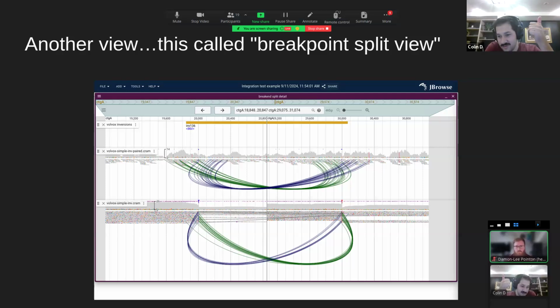Also, I want it to support loading a track into the spreadsheet. So that's kind of the reverse of what you mentioned. And then what you mentioned, which is making the spreadsheet turn into a track, that would be another one. I haven't done that very much.